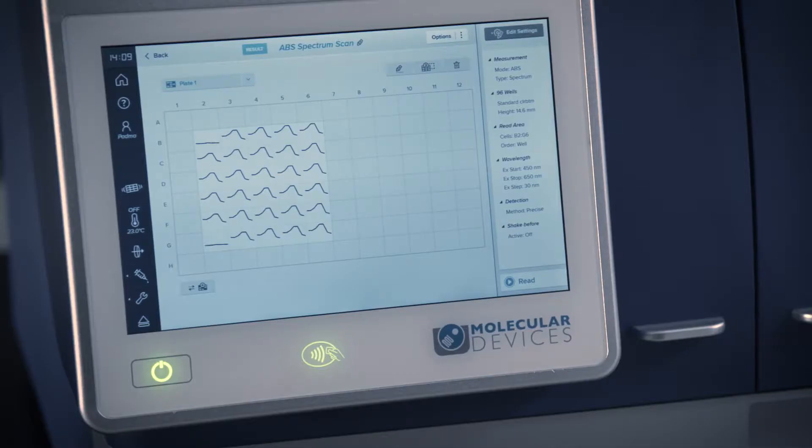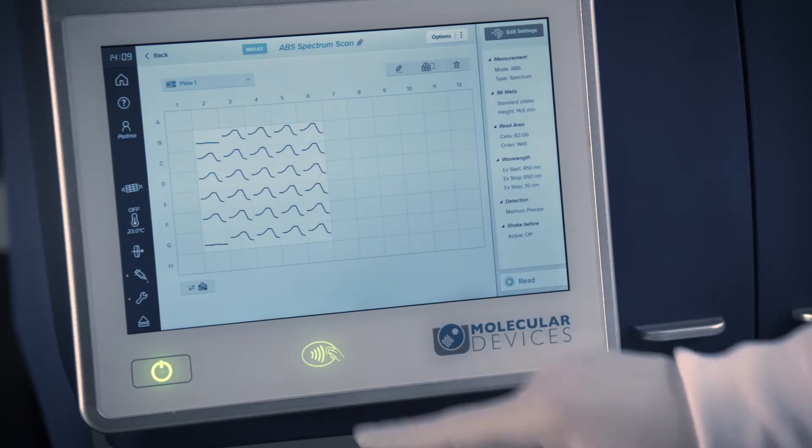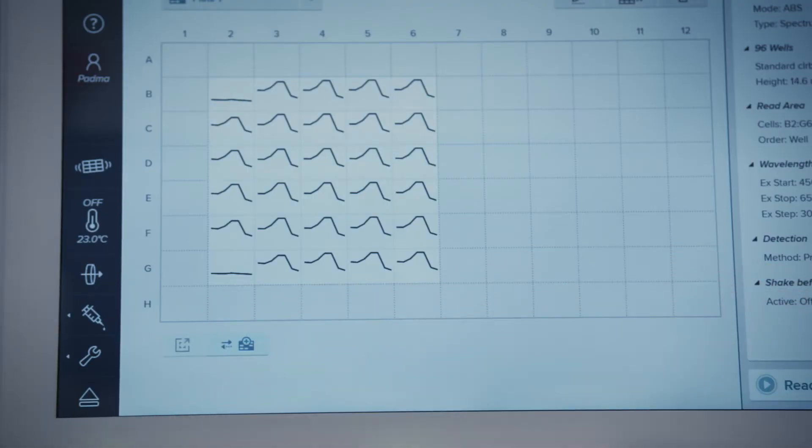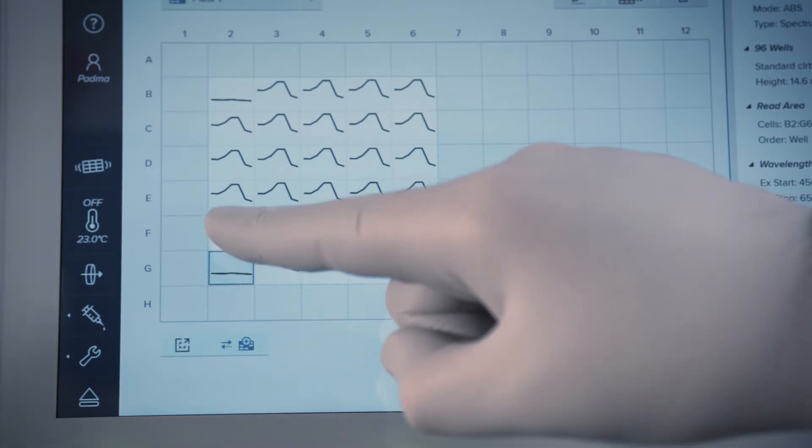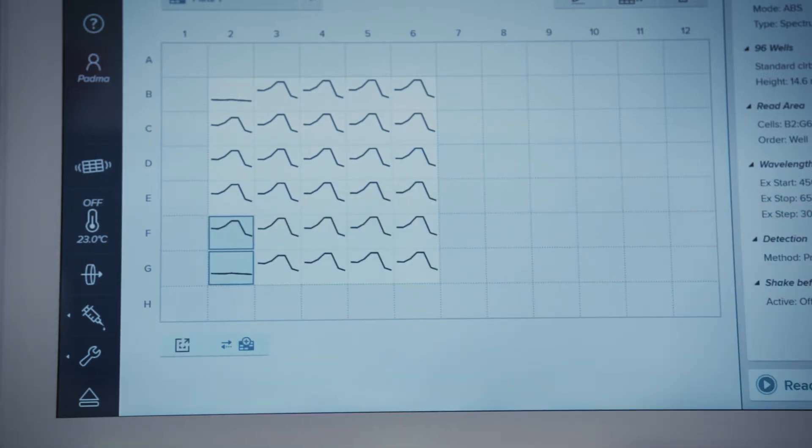To compare the results in several wells, touch the Compare Wells icon. The icon spins and an additional display icon appears. Touch each well you wish to compare. Each well you select displays a shaded background. Touch the display icon to display the well comparison.